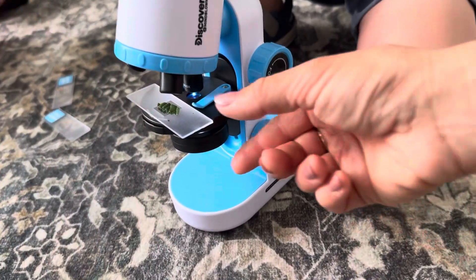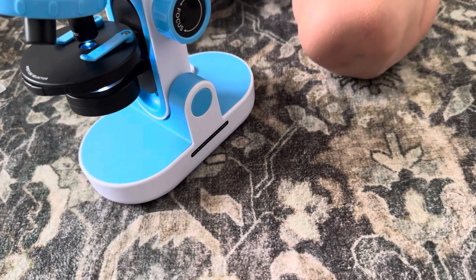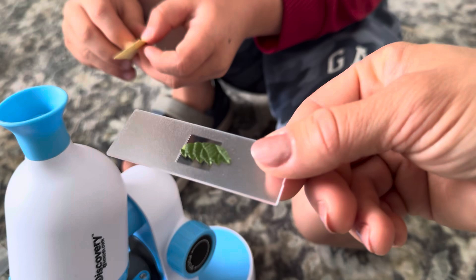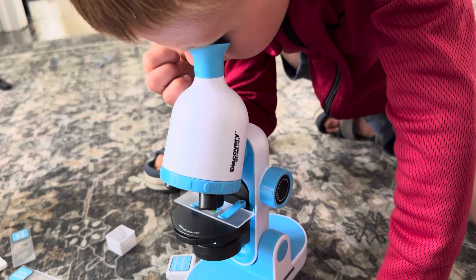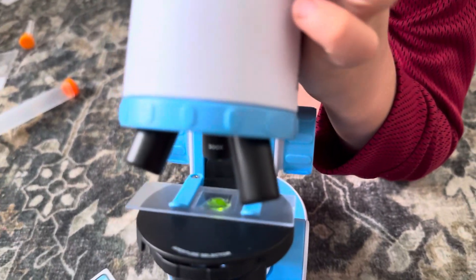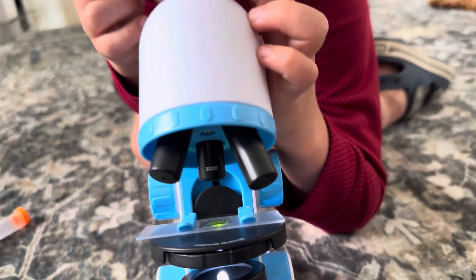Let's check the small leaf, guys. We put it right in here, let's see if we can find anything — we just need to put some tape to cover it. Do you see anything? Do you see it? So we put the small leaf right in here and we can see a little bit of its texture with this 300x lens.